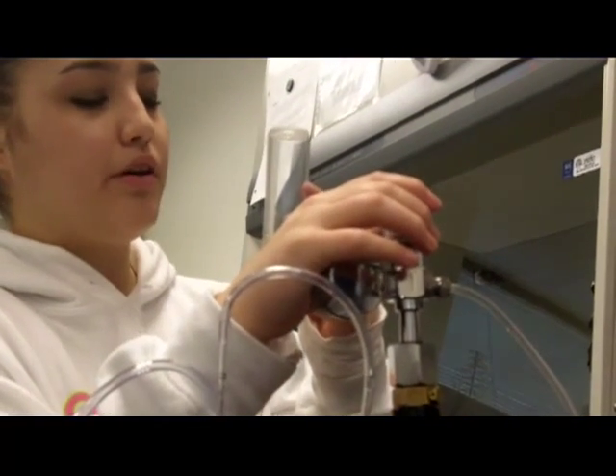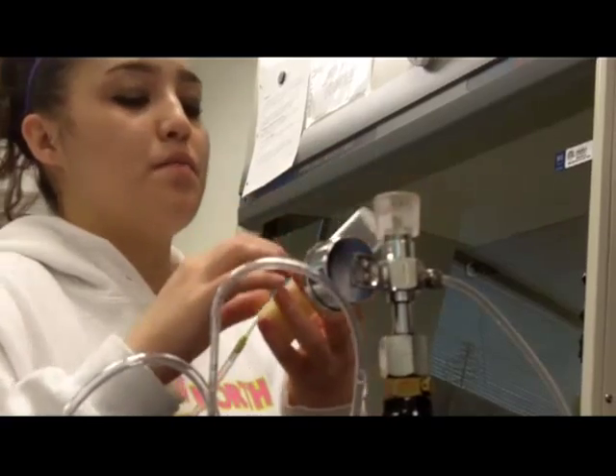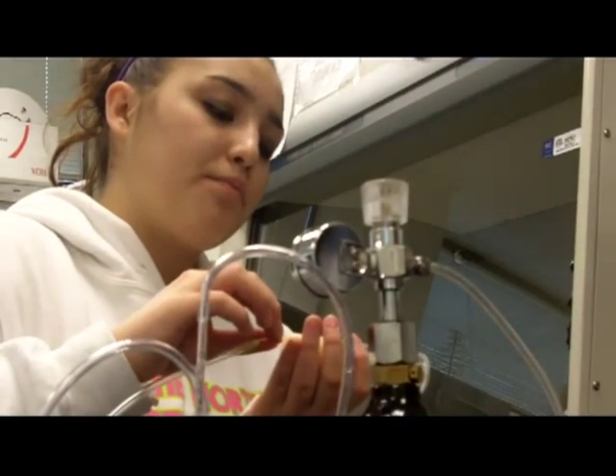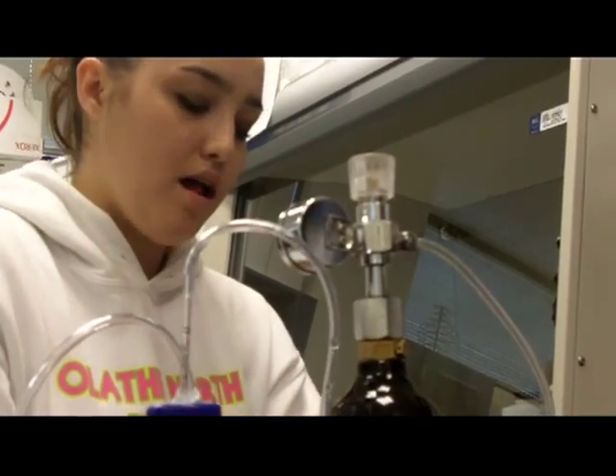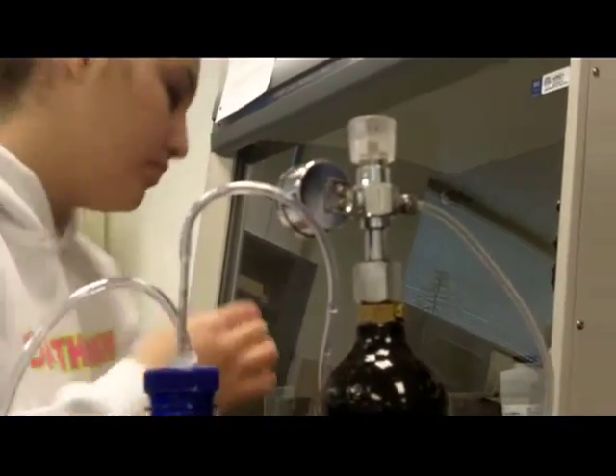They should be asleep right now. The CO2 won't kill them — it'll just make them go to sleep so you can count them. I'm going to get an ice pack really fast.